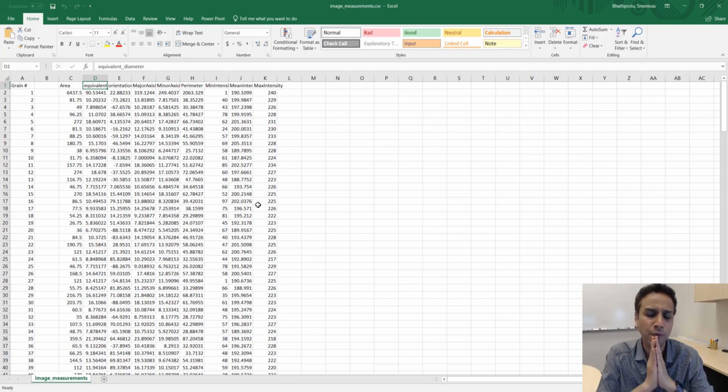I hope you found this tutorial useful. In fact, I started to think it would be more useful if we do the same exercise on hundreds of images. Who analyzes just one image to do grain size analysis? Maybe you have a stack of images, or a folder that has 50 images and you want to run this over all 50. So I'll do that in my next tutorial, because this one's almost 40 minutes now, and I personally watch only very short videos. But anyway, I hope you found this tutorial very useful.